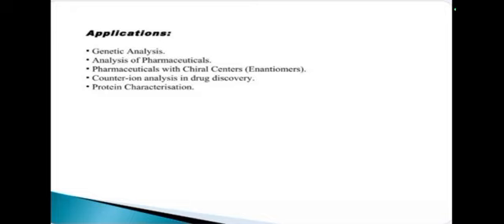Capillary electrophoresis is also used for analyzing the purity of oligonucleotides and RNA, as impure oligonucleotide can interfere with a hybridization reaction. The technique offers adequate accuracy and precision and is of immense help in the development of nucleic acid based therapeutic agents.